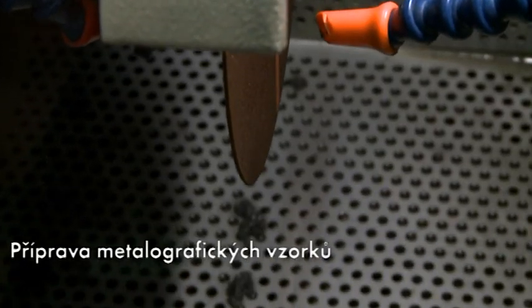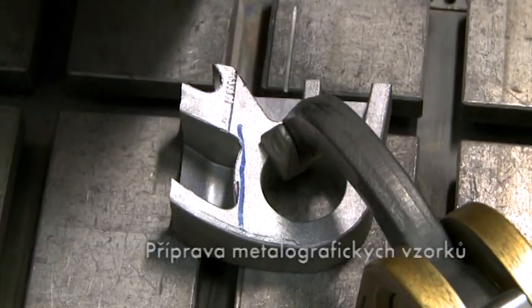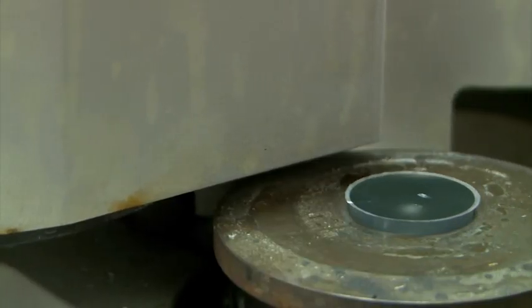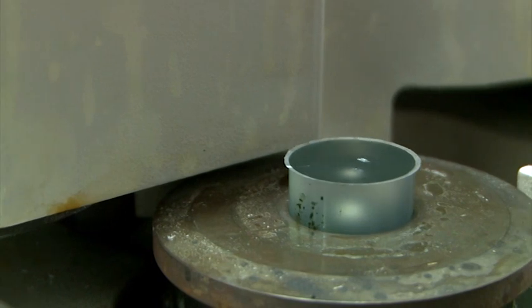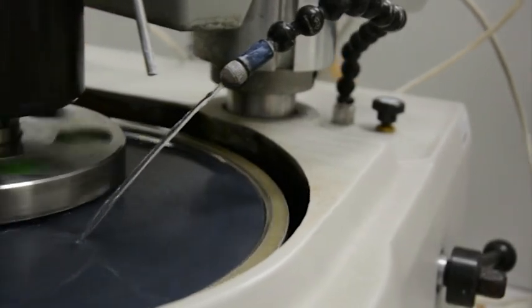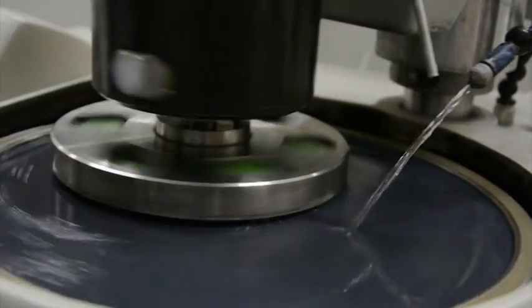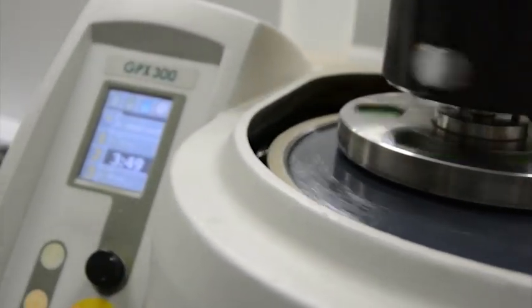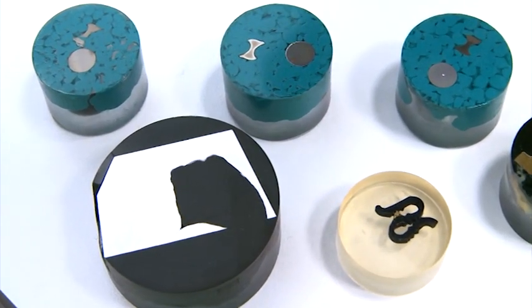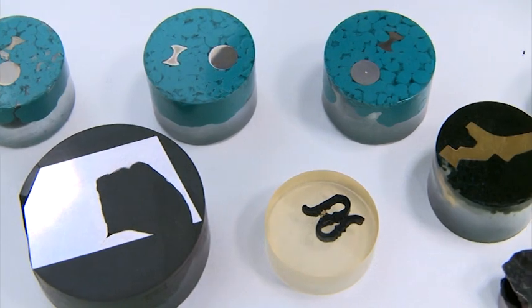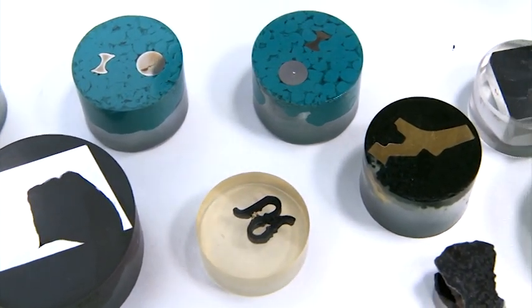Laboratoř přípravy metalografických vzorků poskytuje nezbytnou podporu pro všechny analytické a mikroskopické metody. Zde se čistí vzorky pro pozorování lomových ploch nebo provozních povrchů a také připravují metalografické vzorky v zrcadlovém lesku, které se následně leptají pro vyvolání mikrostruktury.